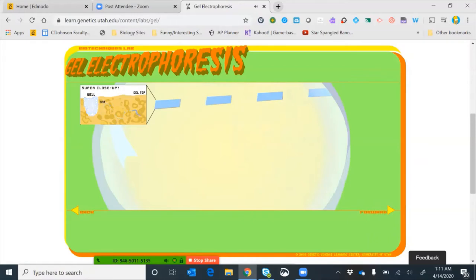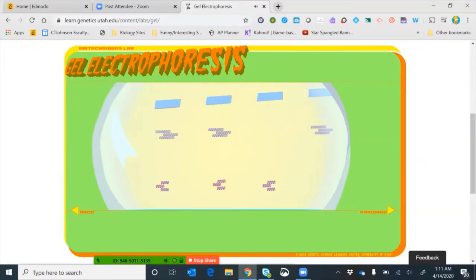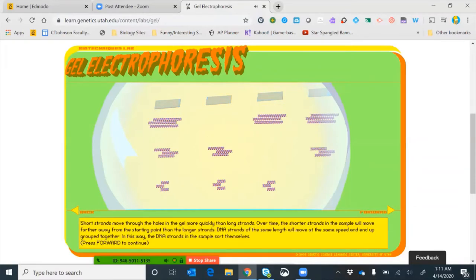You can see the DNA navigating through the gel from one side all the way to the other. Shorter strands move through the holes more quickly than long strands — over time, shorter strands move further away from the starting wells. Larger strands don't travel very far; it takes them much longer to navigate through those Swiss cheese holes. DNA strands of the same length move at the same speed and end up grouped together, sorting themselves by size.